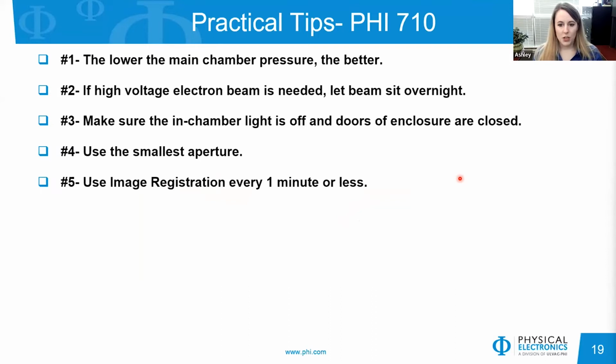The next tip is to make sure when you set up the analysis conditions, you're using image registration at least every 1 minute. At high magnification, it becomes extremely important to account for any drift that may occur over time. So the more frequently you account for this drift, the better.